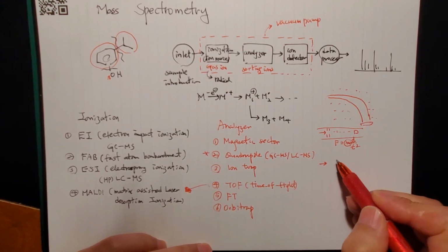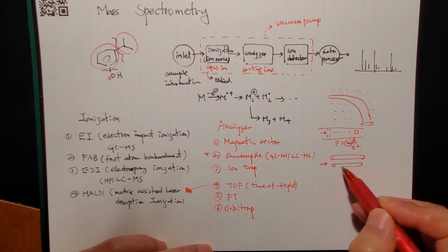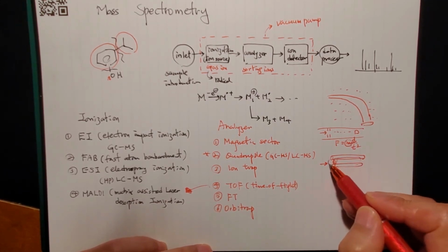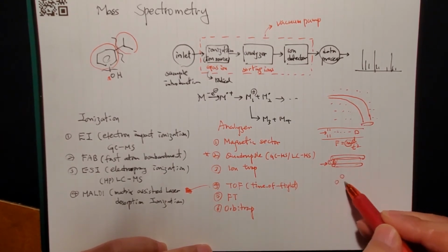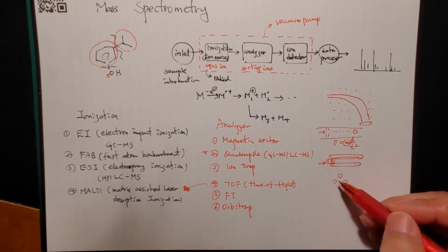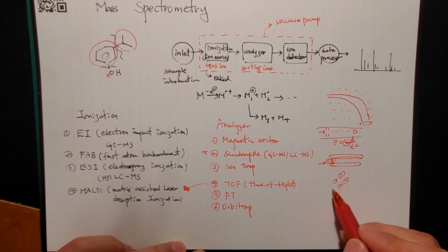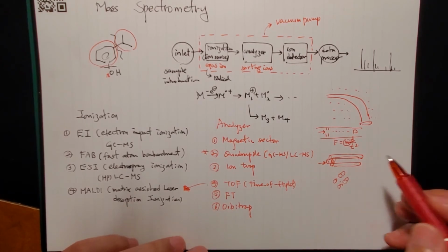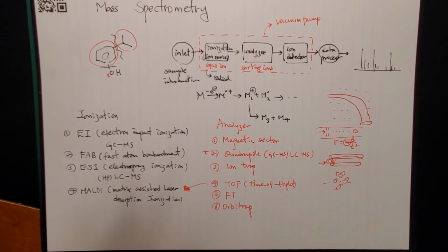Now they are facing 4 rods: 1, 2, and then another one above them, and the other one behind. If you see it from there, you see the profiles of 4 rods. They are going this way. The gas molecules enter here in the middle, and the charges on those rods are changing. It's controlled by the computer.